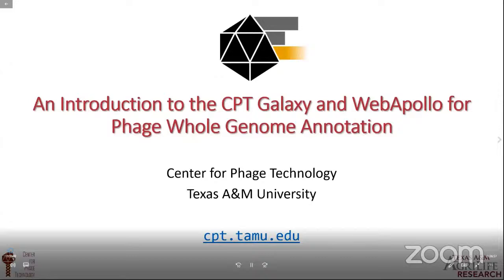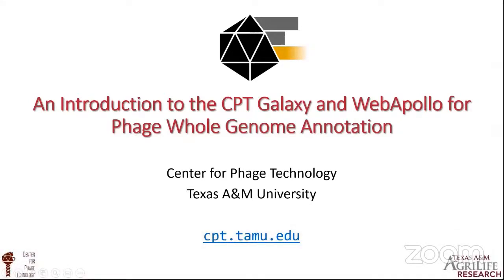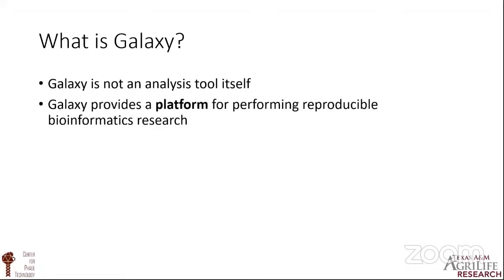Hi, my name is Jason Gill, and I'm a member of the Center for Phage Technology at Texas A&M University. In this video, we're going to talk about the Center for Phage Technology's Galaxy and Apollo platform for whole phage genome annotation and analysis. First, we'll start off by talking about what is Galaxy. Galaxy is not an analysis tool in itself. Galaxy provides a platform for performing reproducible bioinformatics research.